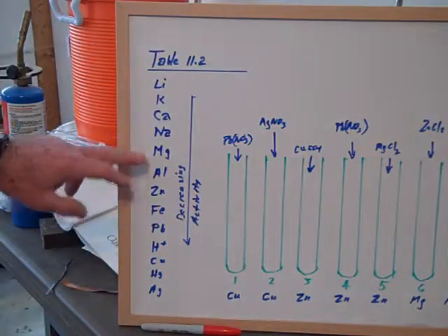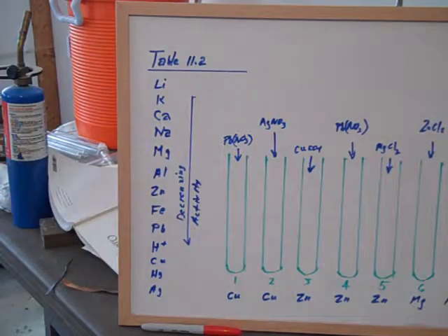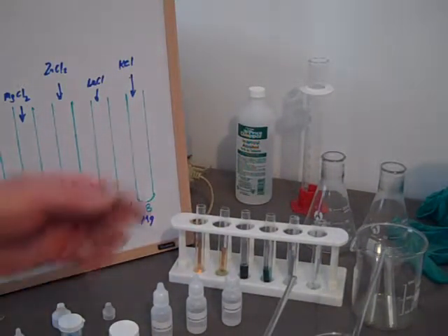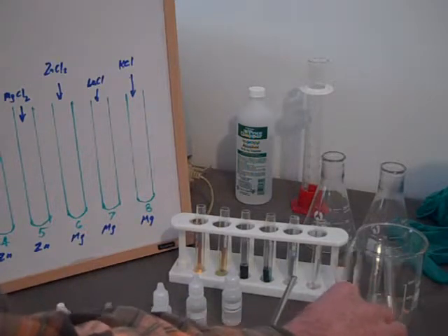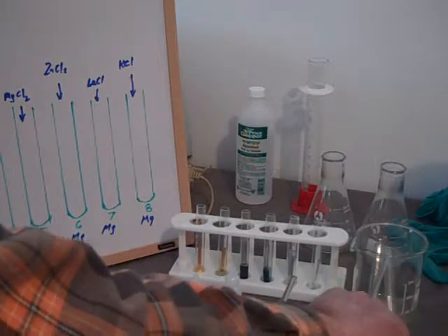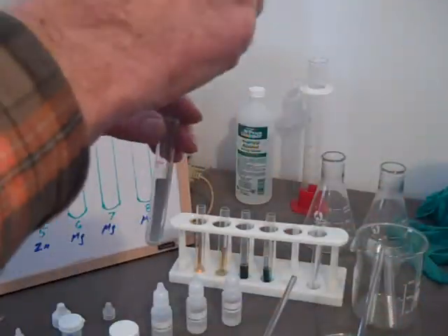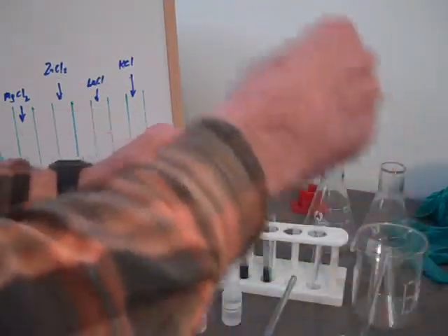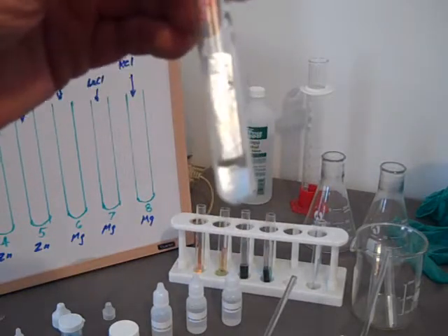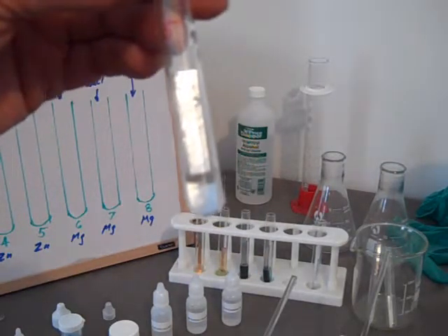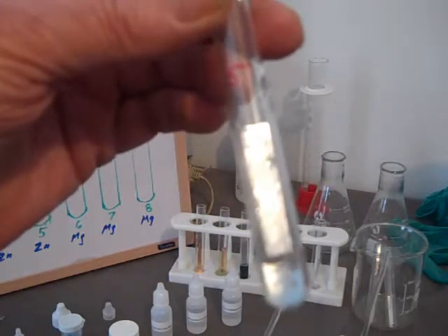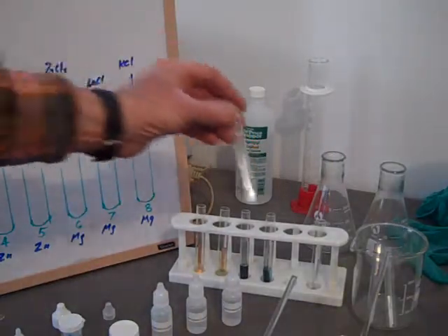Now we're going to do number 5, zinc and magnesium. But zinc is lower than magnesium, so we shouldn't get a reaction. Let's take a look and see what happens as we add magnesium sulfate, because we don't have any magnesium chloride, to test tube number 5. And certainly for the time being, we're getting no reaction. That's what we predicted. That's fine. So zinc will not replace magnesium. Magnesium is pretty high on the activity series.